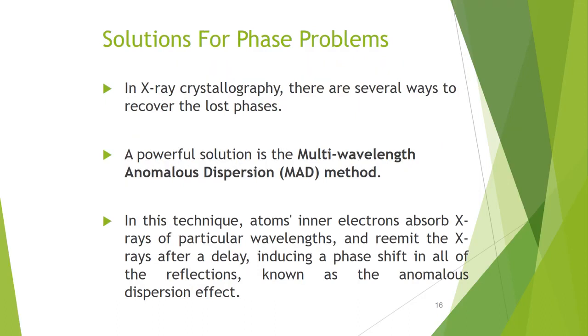Solution for the phase problem. In X-ray crystallography, there are several ways to recover the lost phases. One powerful solution is the multiple wavelength anomalous dispersion method, known as the MAD method.